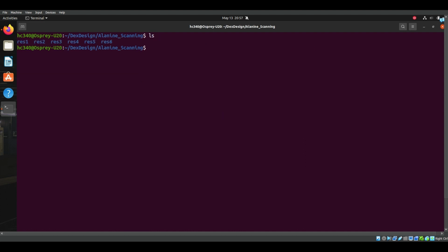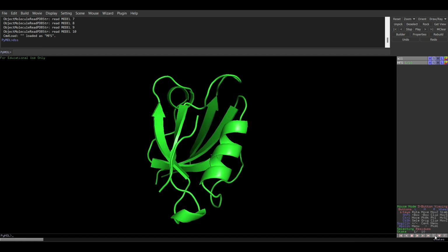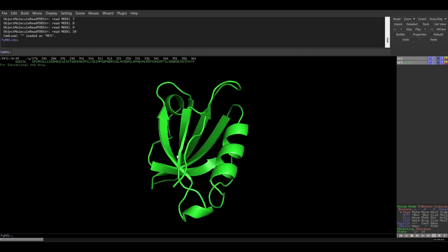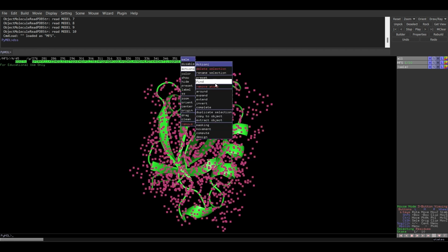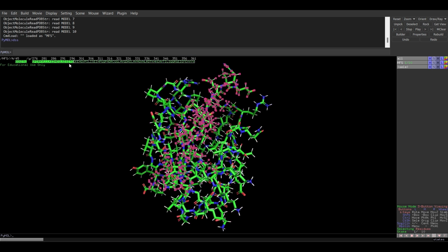Great. So now that we have those, we're going to jump over to PyMOL for a quick visualization. Quick reminder, this was our output from the minimum flexible set. This is our D-peptide in complex with our L protein with steric clashes alleviated. So let's again visualize these a little bit better. Show as licorice sticks. Again, I like my peptide to be in purple. It's a little bit easier to see.